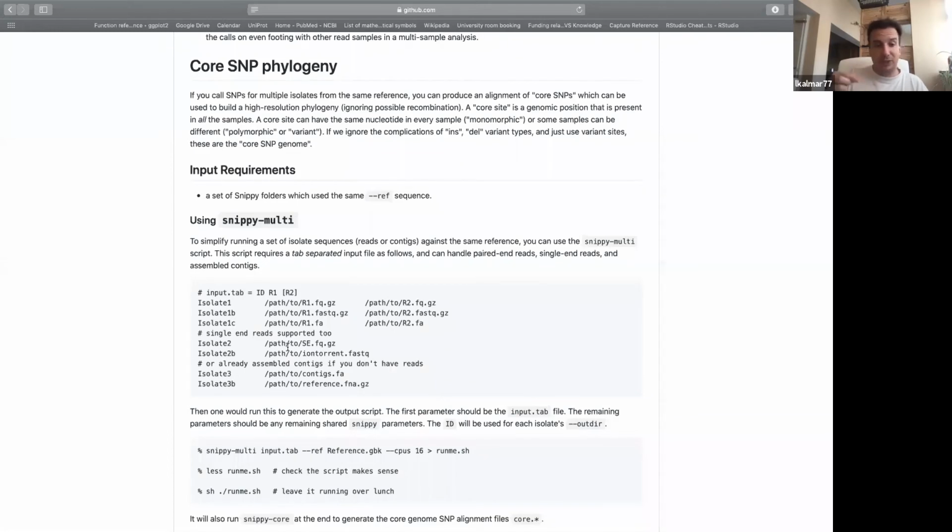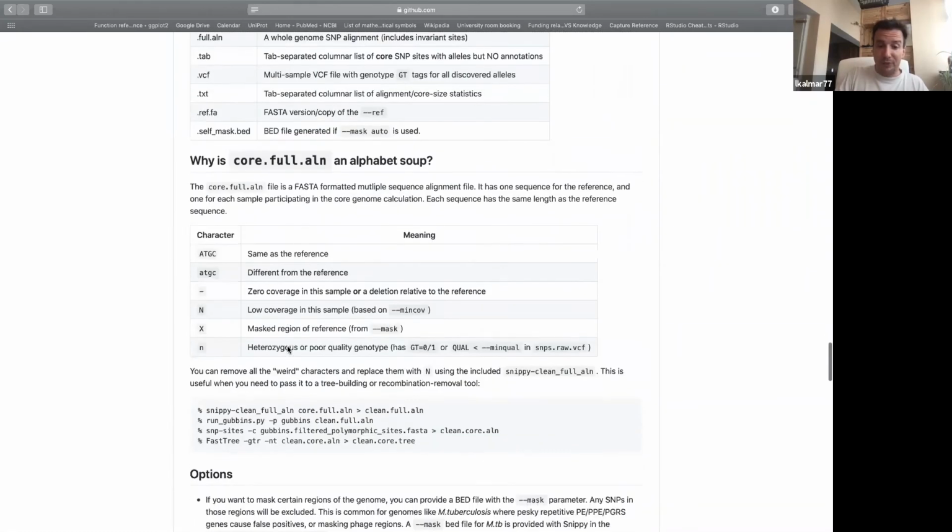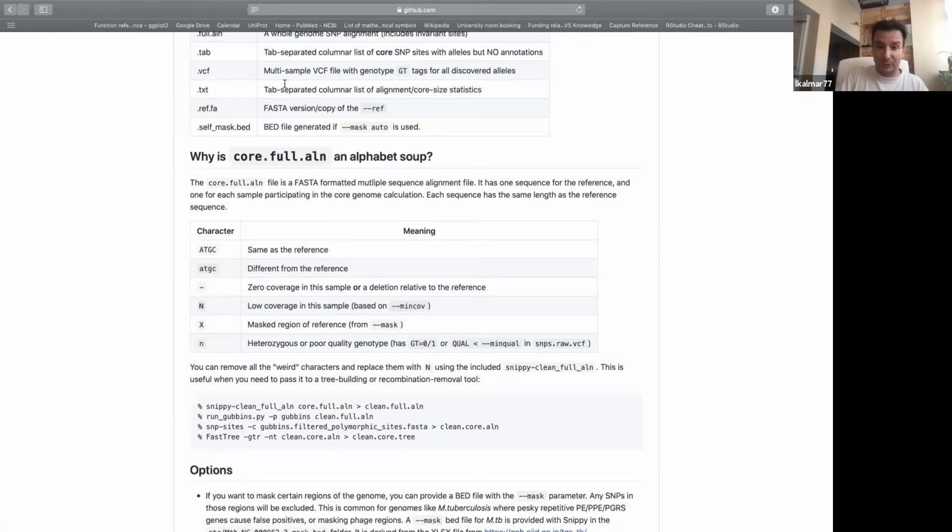SNP multi is actually running multiple SNP processes, and at the end you will be able to use the final output, which is here, to gain the tree or the distance matrix. So you just have to follow these steps, which again I don't want to go through now. I just want to tell you when you have to use this.